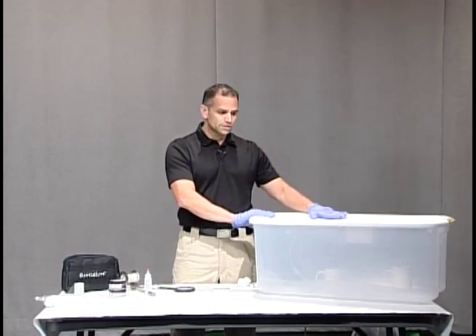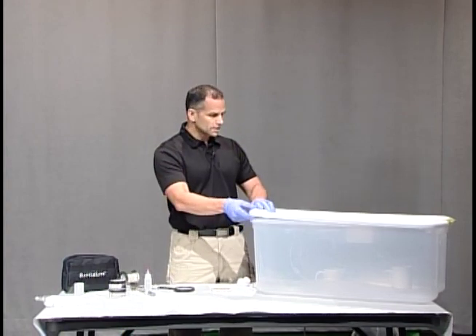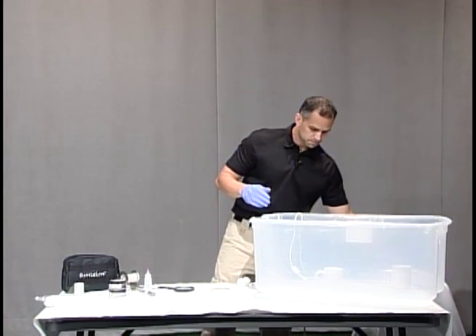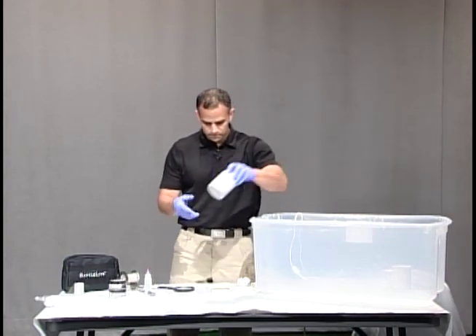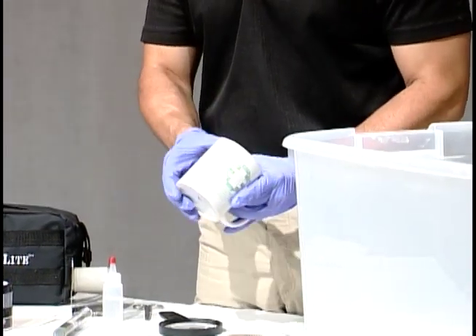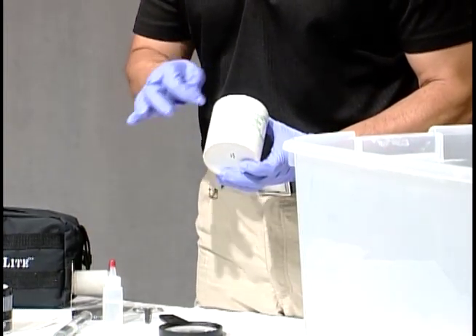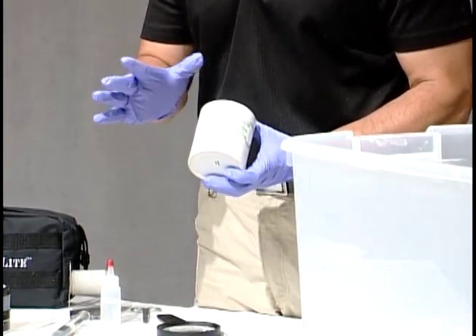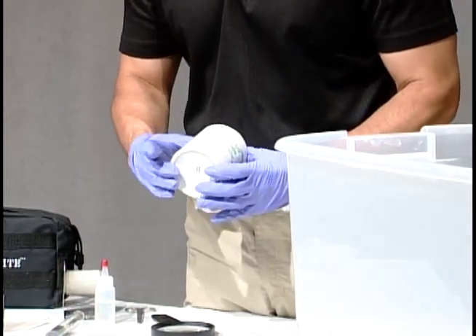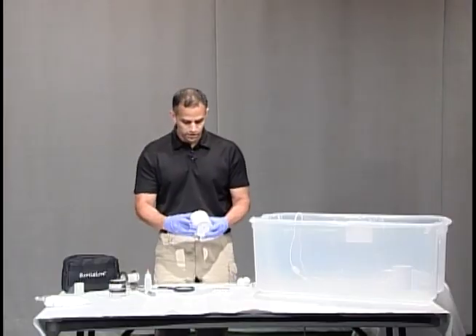For the purposes of today I've already fumed these items, so there are no fumes in here. I'm going to open this up and take our item out. Now our item would be super glue fumed. It is possible that you would be able to see the fingerprints on the cup before you even process it after super glue fuming, but these aren't sticking out at me, so we're going to actually dust for fingerprints with this.